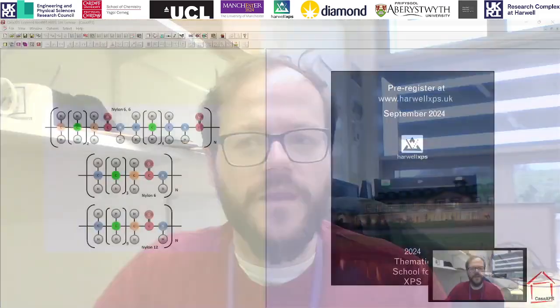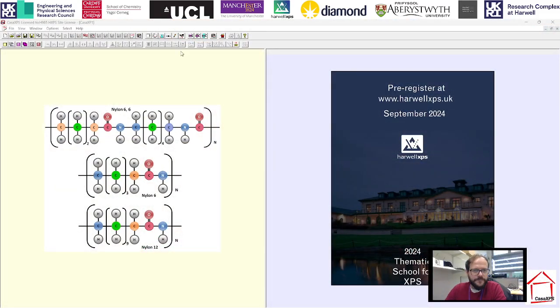So whether you're calibrating to an individual feature within an unknown, if you're calibrating the carbon, or for example you have a load of nanoparticles on a common silicon support, calibrate to all of the silicons. There's a really nice way of just doing this really quickly, making sure everything's lined up nicely in CASA. So jumping across to CASA now.